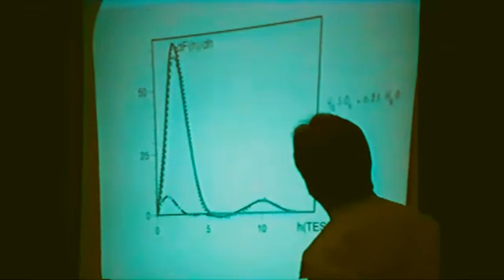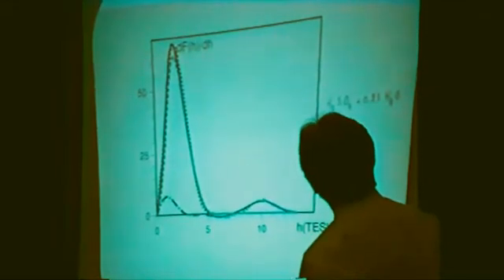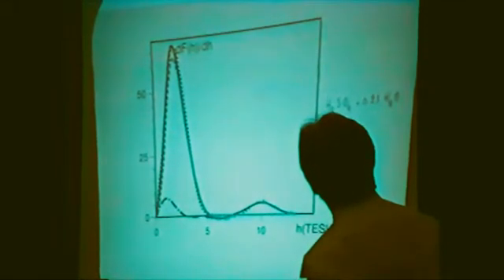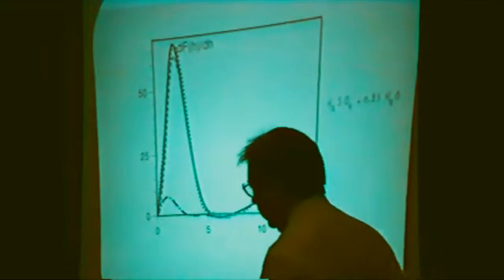We started with pure sulfuric acid and added water little by little. As we have seen previously, we have only one signal, and the position of the signal, the chemical shift, decreases, of course, with the concentration of water, because the average chemical shift decreases. But in that case, of course, we don't have any problem with detection. You see that we have in green the experimental signal, in red the simulation, a perfect simulation, and you see that you form hydroxonium ion. We have adsorbed 25% of water with respect to the acidic OH group, and the residual concentration concerns, of course, the residual acidic OH.